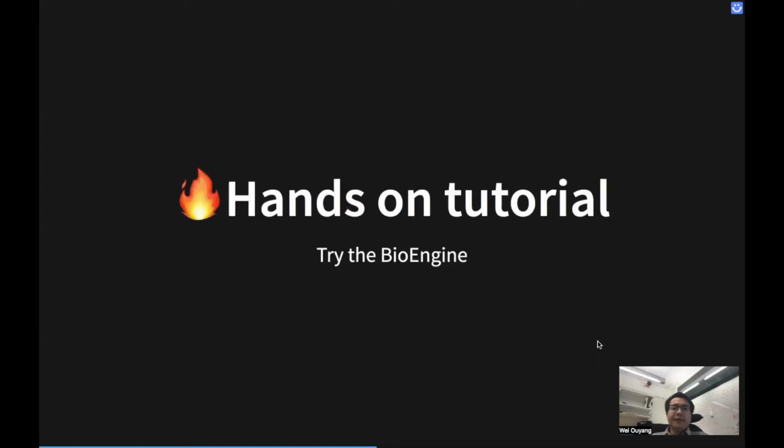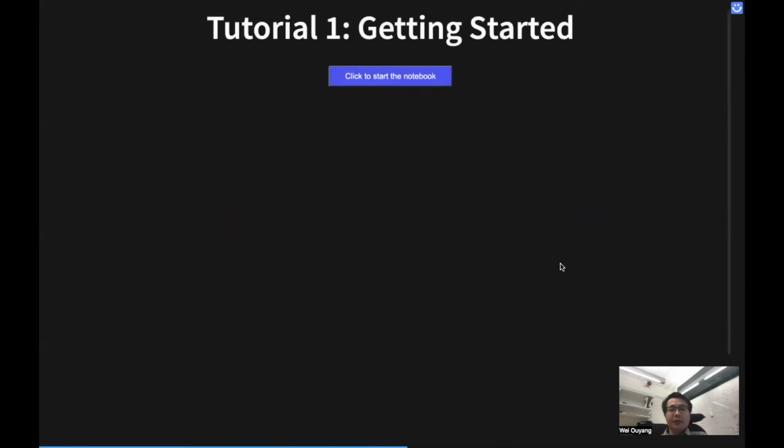So in the next section, we're going to show you a tutorial, and feel free to follow along. When you see this video, I guess you will get the link, and feel free to open the link with the video on the side, and then you can just follow the tutorial with me. So in the next slide, we have this getting started tutorial.